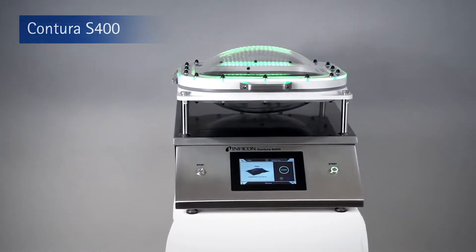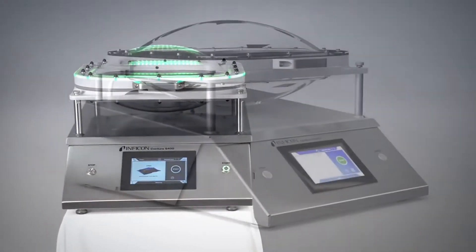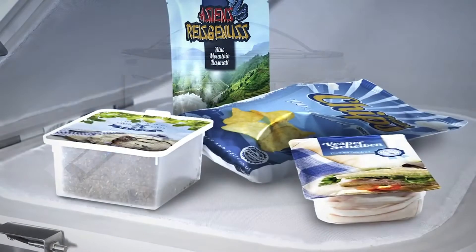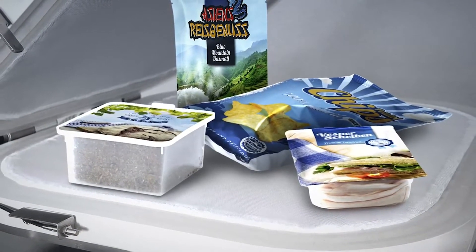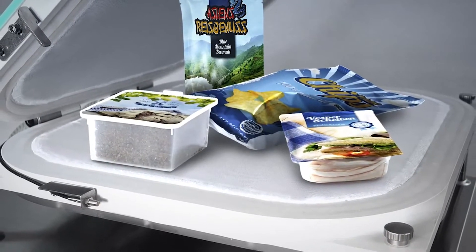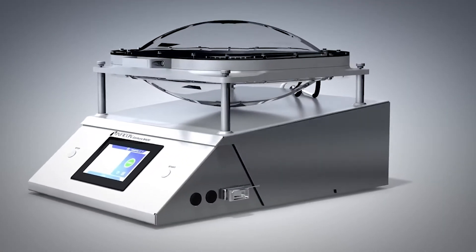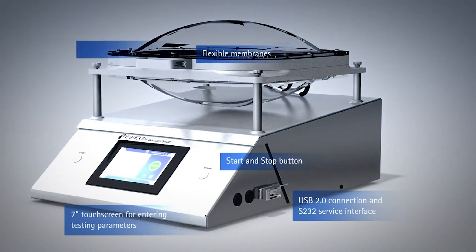The innovative Contura S400 leak detector gives manufacturers of food packaging machines as well as the food industry a unique solution for detecting leaks in MAP and other flexible packaging. It does not matter if it is a gross leak or a tiny one that is not detectable to the naked eye or the water bath method. The unique technology of the Contura S400 can detect any leak without the need for test gas and without damaging the packaging.